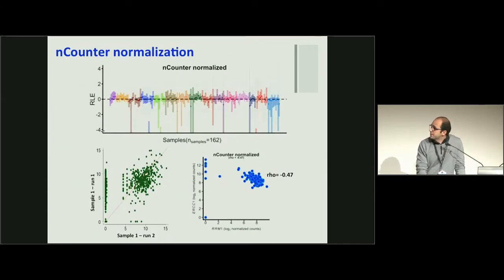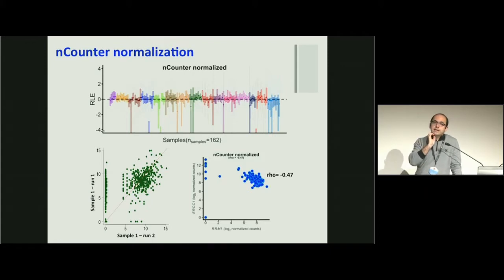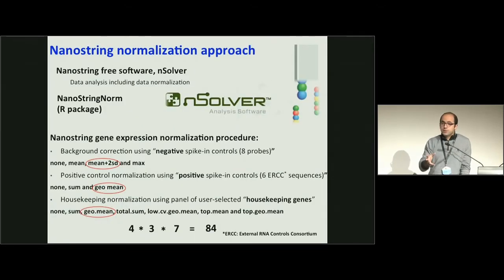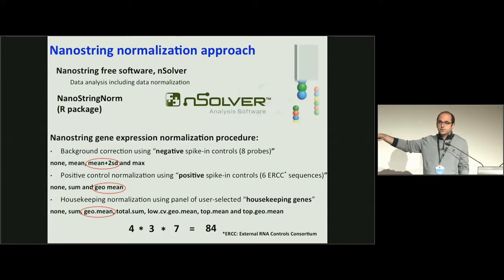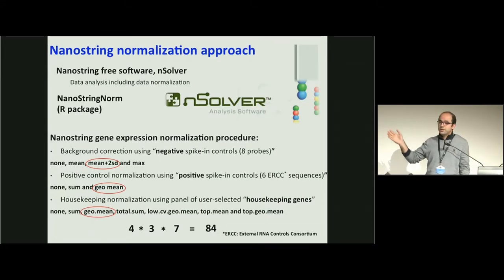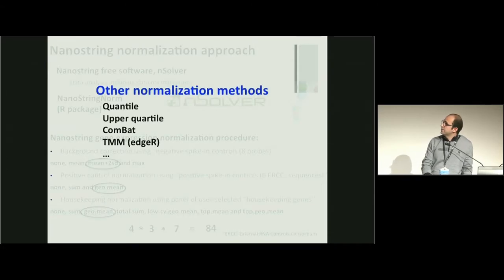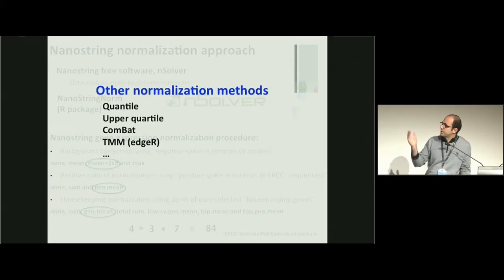Having a bad RLE plot, poor correlation between technical replicates, and wrong biology motivated me to use another normalization method. I did all 84 normalization options and none of them was good enough. I also looked at other normalization methods like quantile, upper quantile, ComBat, and TMM. They didn't work because these methods are initially designed for RNA-seq or genome-wide platforms.